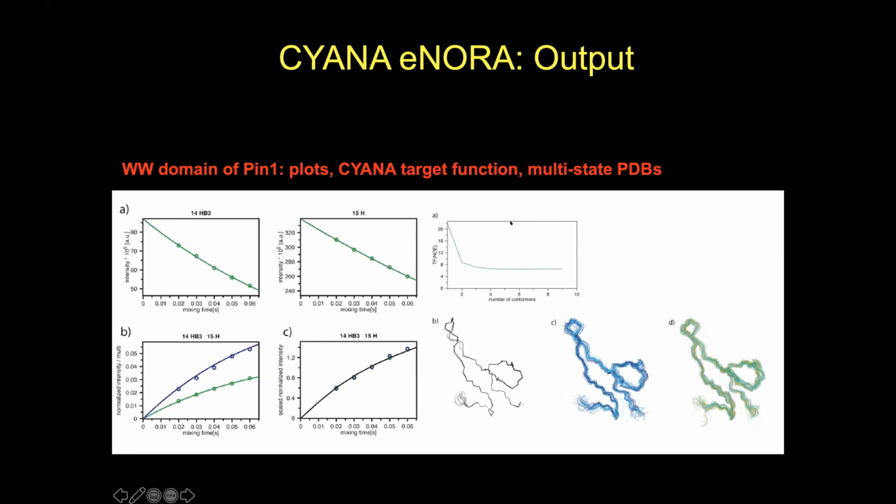And then you have the output here. I have 3 examples. So that would be the output if you allow one state. In that case, we have such high quality of the data that it looks as if you have only one structure, but I think it's a superposition of probably 10 or 20.